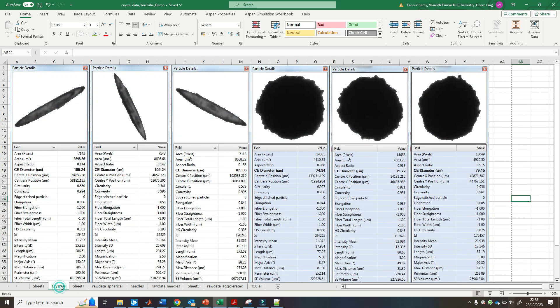There are three categories in the population, and to quantify them, we place crystals under a microscope and collect morphological parameters. These include area (in pixels or micron squared), aspect ratio (length divided by width), equivalent circular diameter, circularity, and convexity — which is especially useful for agglomerated crystals.